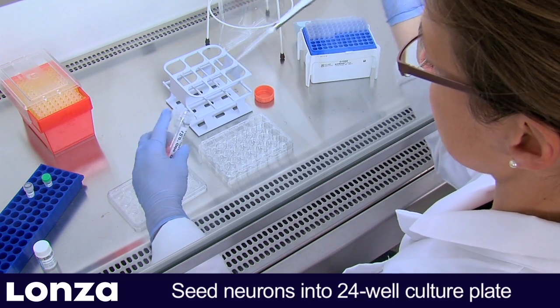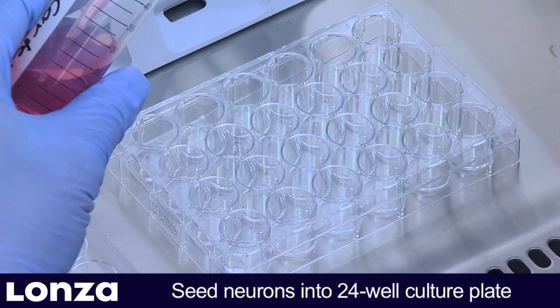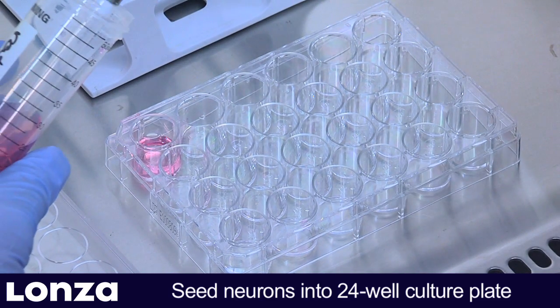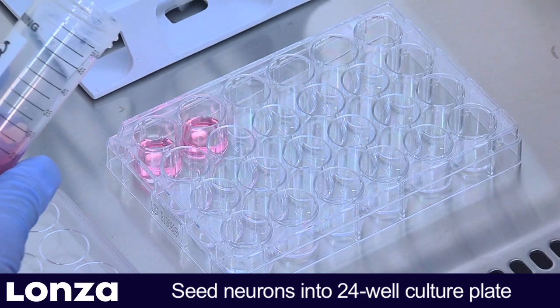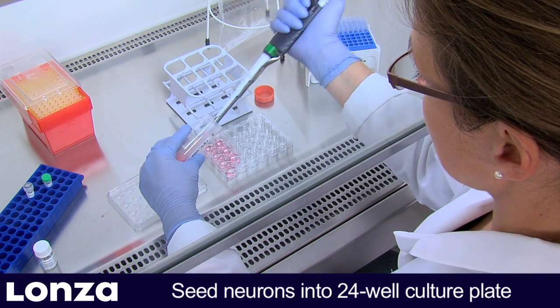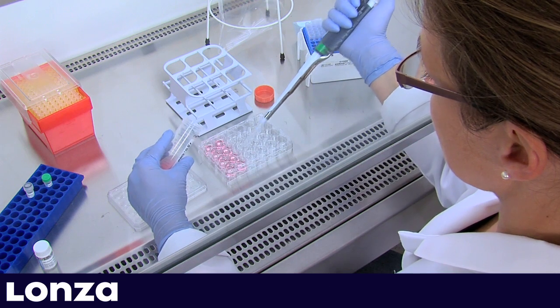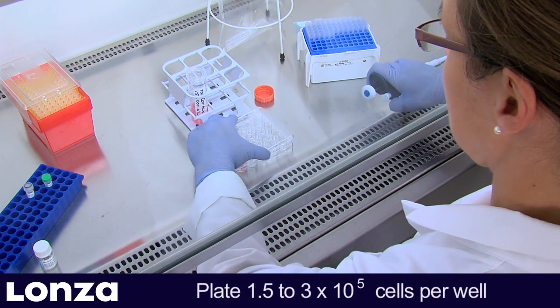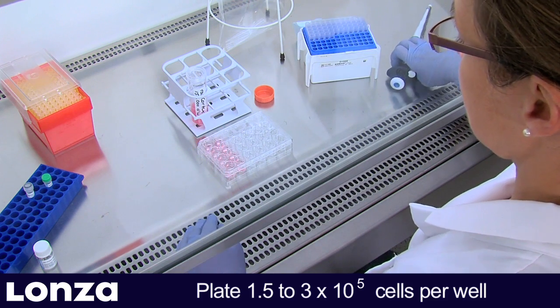The first step is to seed the neurons directly into 24-well plates or onto glass coverslips. Please use plates from Greiner or NUNC, or contact our scientific support to check for compatibility of alternative plates. We recommend plating of 1.5 × 10⁵ freshly isolated or 3 × 10⁵ cryopreserved neurons.